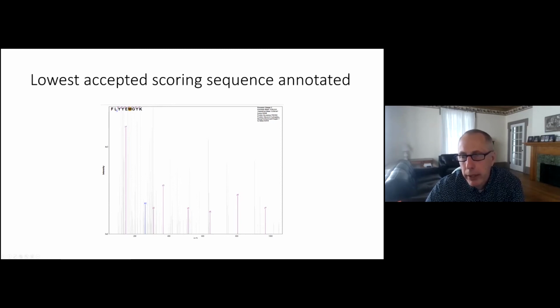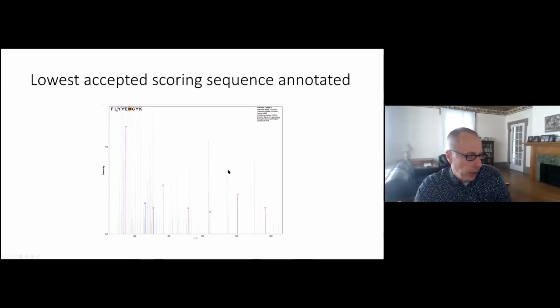In fact, if you look at the score, we have basically only accounted for about 5% of the intensity of this spectrum for this match. You can probably easily imagine how many other spectra could match at random to the variety of peaks that are here at a level equivalent to what we got here. The fact that we think this is a good match is owing in part to the fact that we have so many consecutive ions in a row, and it's not just totally scattershot.